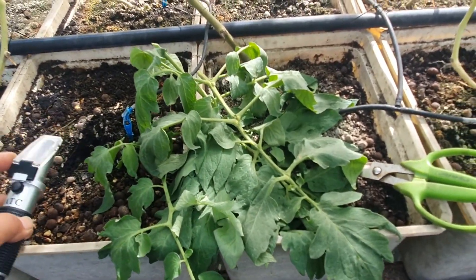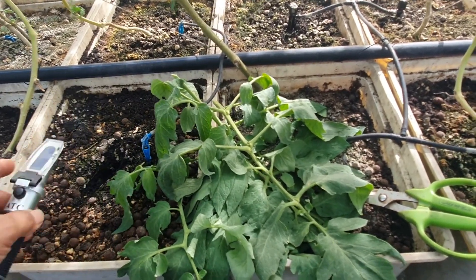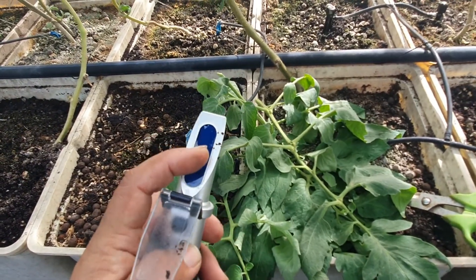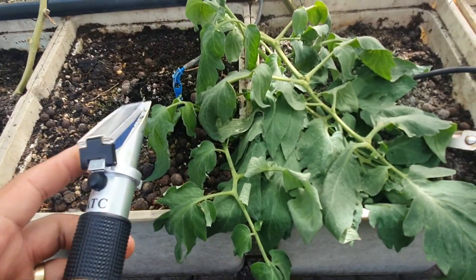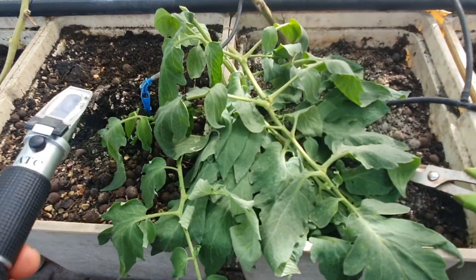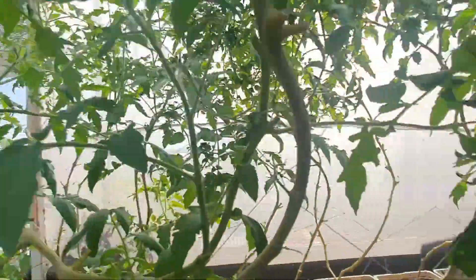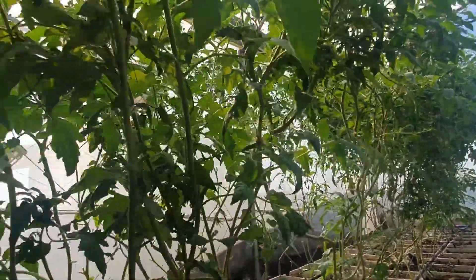What you can also do is cut off some leaves, like I did here, and press the liquid out — either using a kitchen appliance or manually by wrapping it in plastic and wringing it with your hands. You only need a few drops. I measured this morning using this Brix meter with these leaves, and the result was about 8% Brix.